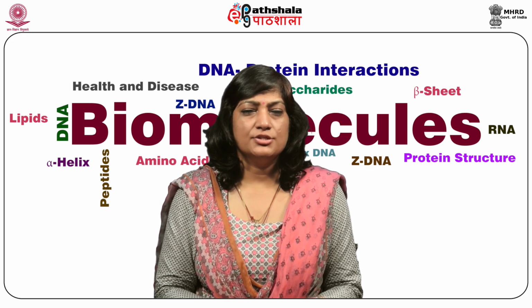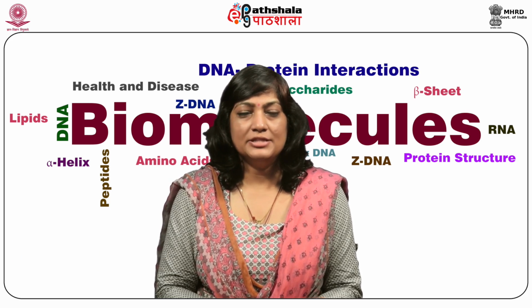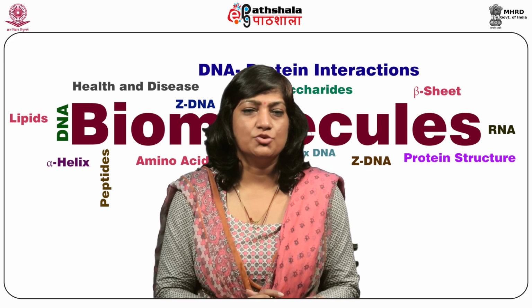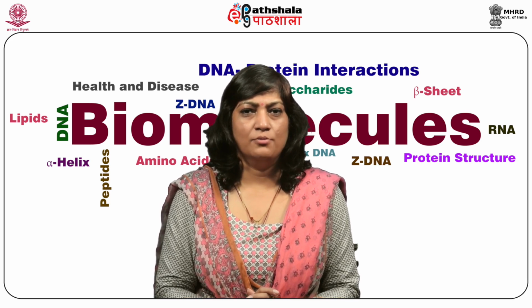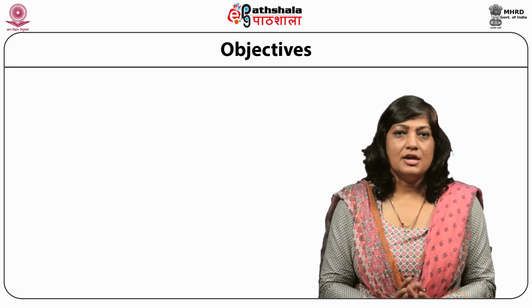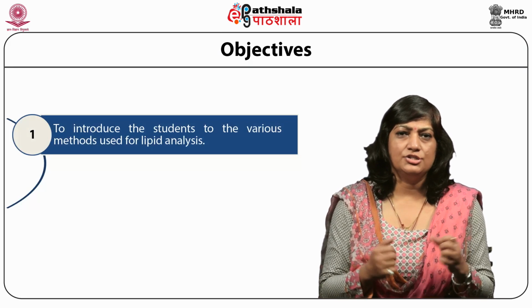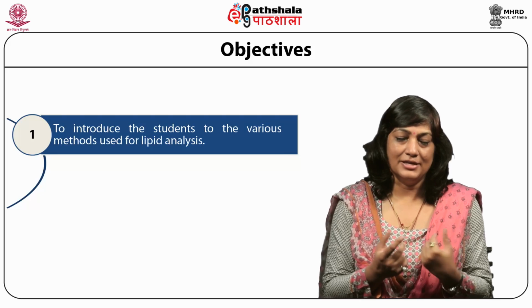Today we are going to talk on the module titled Working with Lipids, where we are going to discuss different methods that are used to extract lipids and analyze them from the paper Biomolecules and their interactions. So the main objective or aim of this module is to introduce you all to the different methods that are used for analyzing lipids.